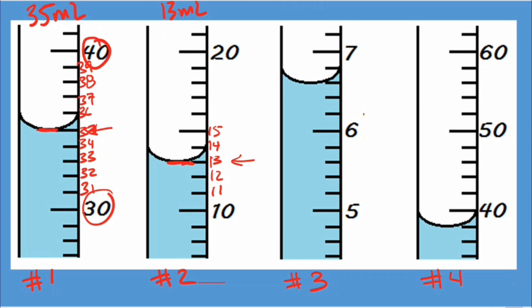Now the third graduated cylinder got a little harder. If you're looking, we know the numbers are between six and seven, so it can't go by one. It's going to go by 0.2 milliliters, so it must be a smaller graduated cylinder. We look at the bottom of the meniscus right here. We know it's 6.6 milliliters.